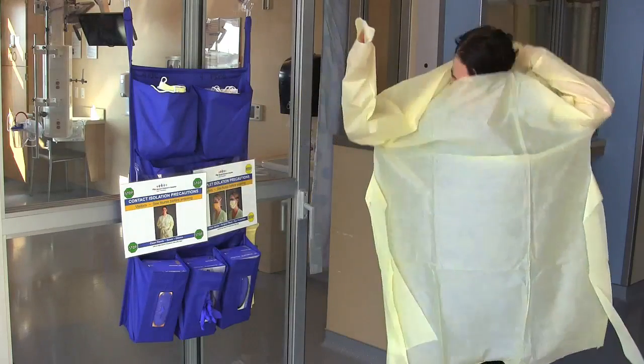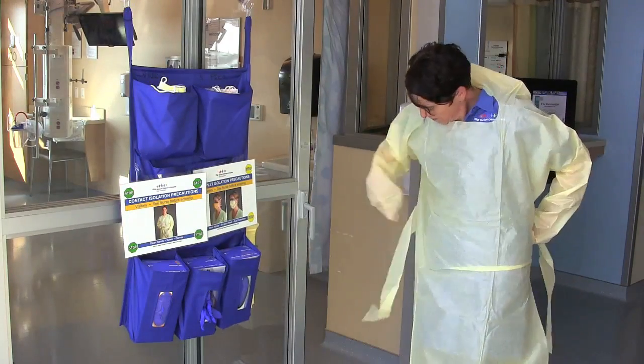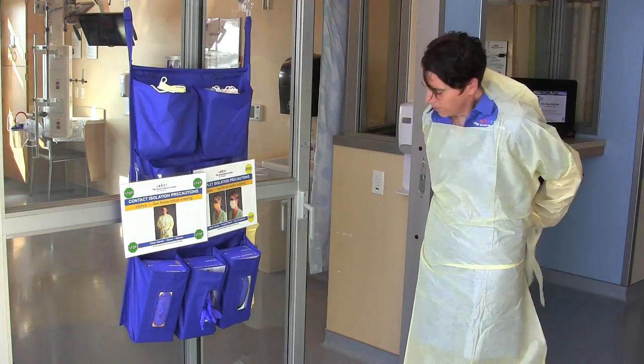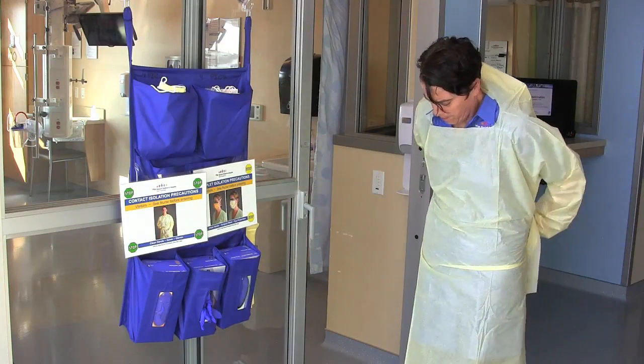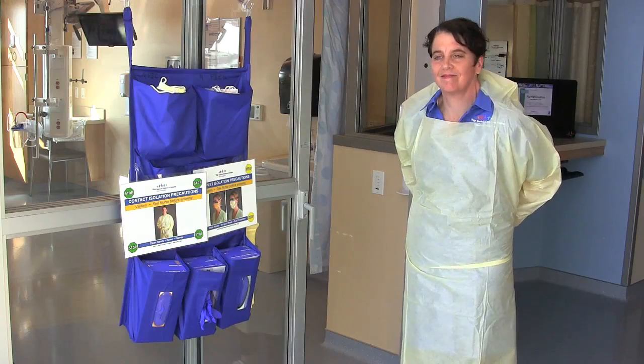Put the gown on to completely cover shoulders. If there is a neck and waist tie, tie the gown at the neck and waist. If the gown slips over the head, do so and tie the gown at the waist. If the gown has thumb holes, do not yet put the thumbs through the hole.